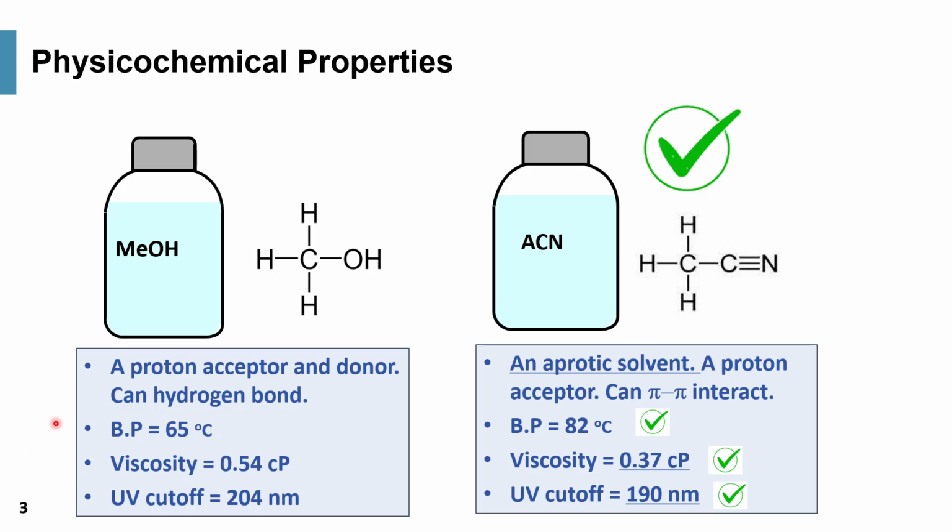From the boiling point view, methanol boiling point is 65 degrees C, while acetonitrile is less volatile at 82 degrees centigrade, which is somewhat better from the toxicity point of view on inhalation risk. And also, acetonitrile is somewhat less acute toxicity as that of methanol.